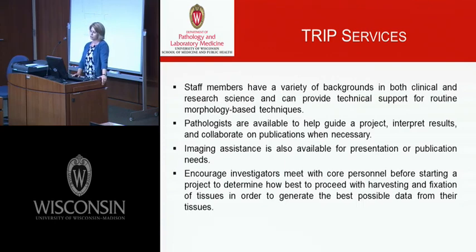And we strongly encourage investigators that are new to utilizing human tissue or even rodent or animal tissues to meet with individuals within the TRIP lab to help get them started with their project as it pertains to either harvesting their tissue or fixing the tissue, in order to generate the best possible data from those resources.